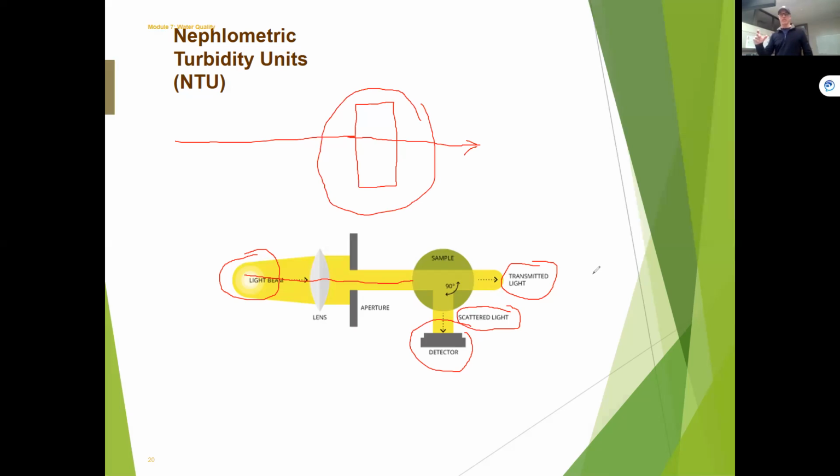scratched. That's the first thing I do when I go to a plant. I'll check and see how clean those vials are, and if they're scratched, they should be replaced. They've got to be super clean too. And I never ever touch the area where the light's going to shine through. I might grab it at the top or at the very bottom, but I try to keep my fingers off anything in between.